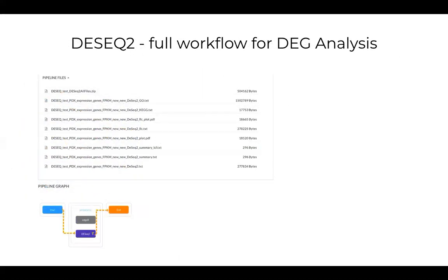But when you look into the output of DESeq2, which is there in transcriptomics too, and also in our pipeline, which I will just show you, we will end the presentation today and then discuss it again in our next class on 3rd February. One of the key aspects of running DESeq2 is that you get a lot of information.